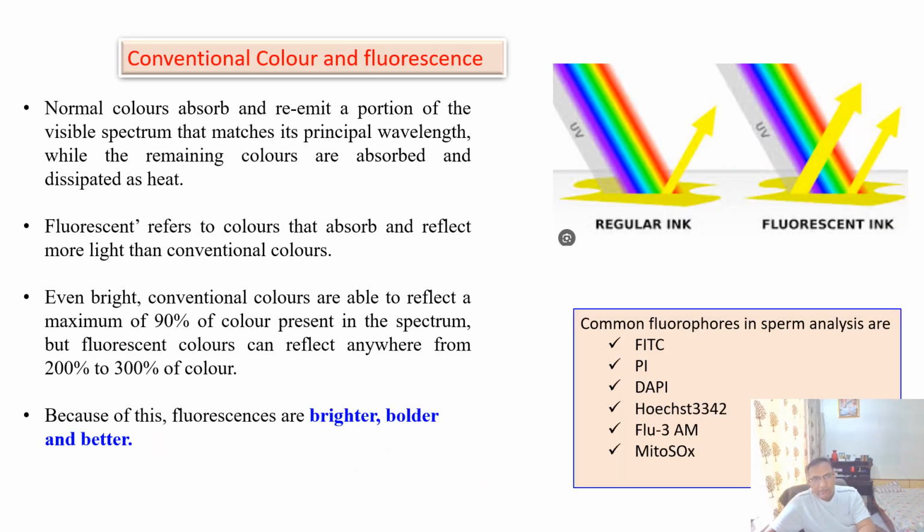So here we learn how a fluorophore is excited by a certain wavelength of light. Not all light can excite the electron of a certain fluorophore to emit fluorescent color. It is specific to each fluorophore what light wavelength range can excite it.